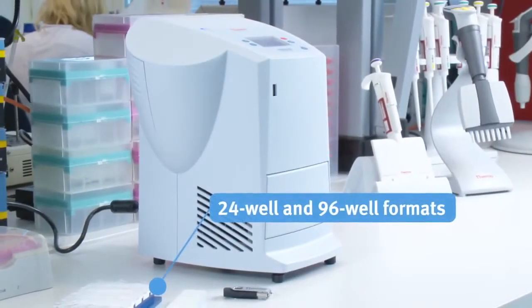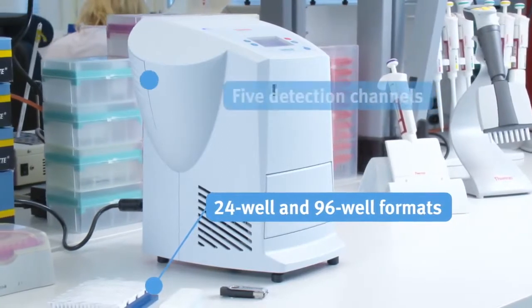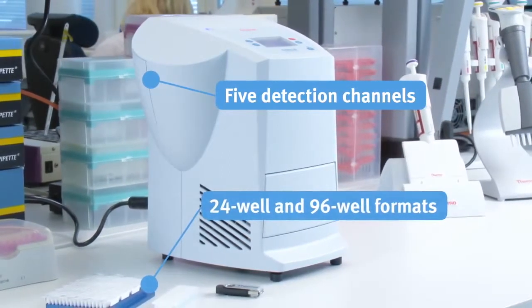The system is built using Pico format and technology which enables considerable savings in the running costs.